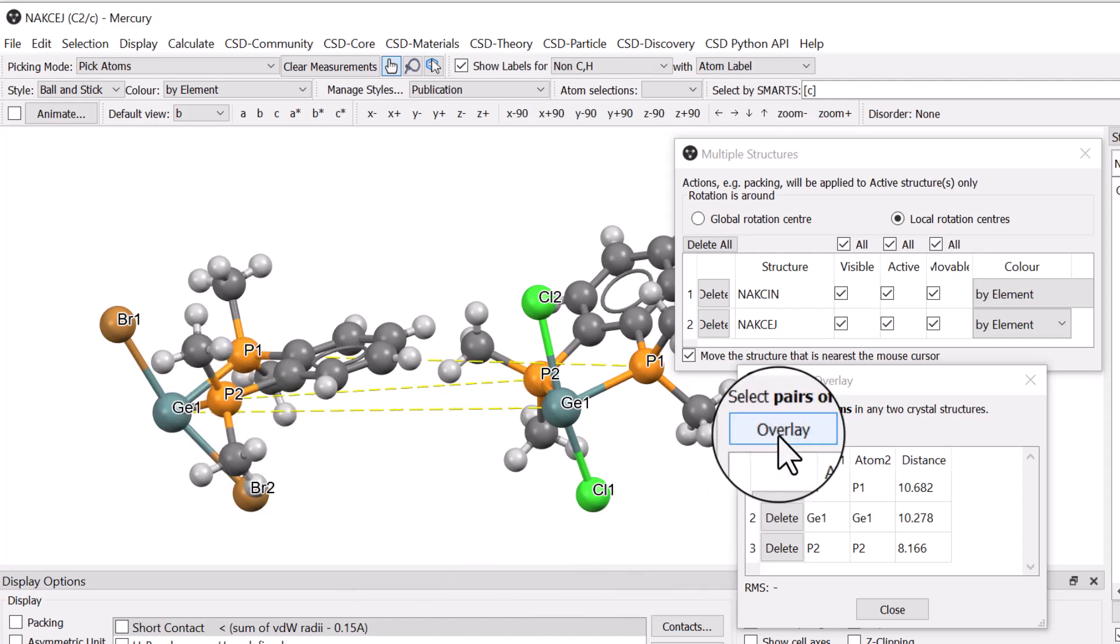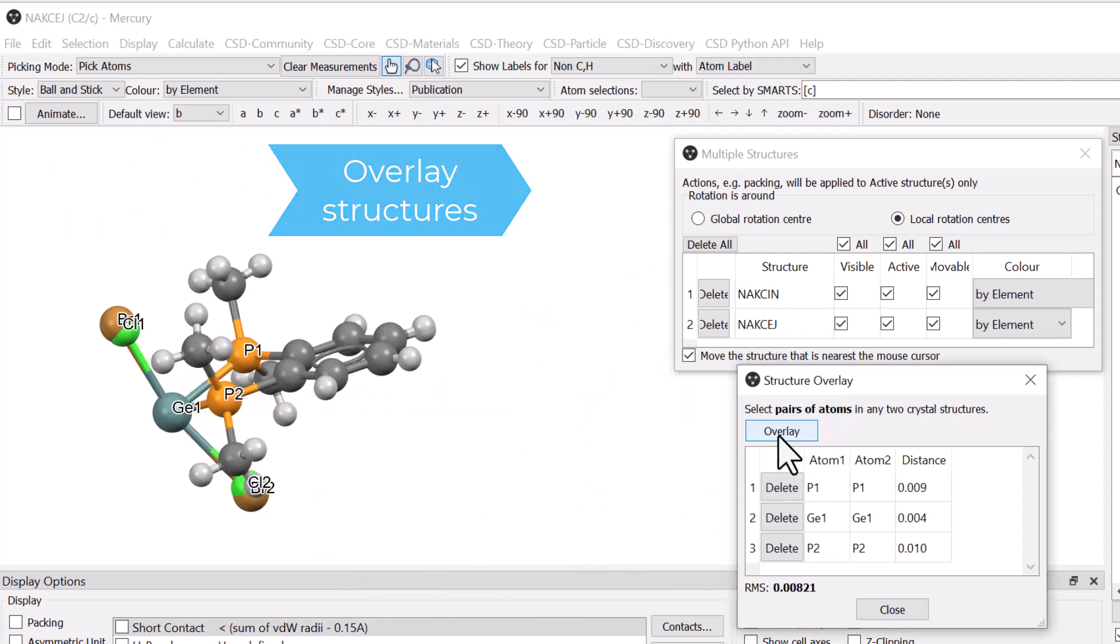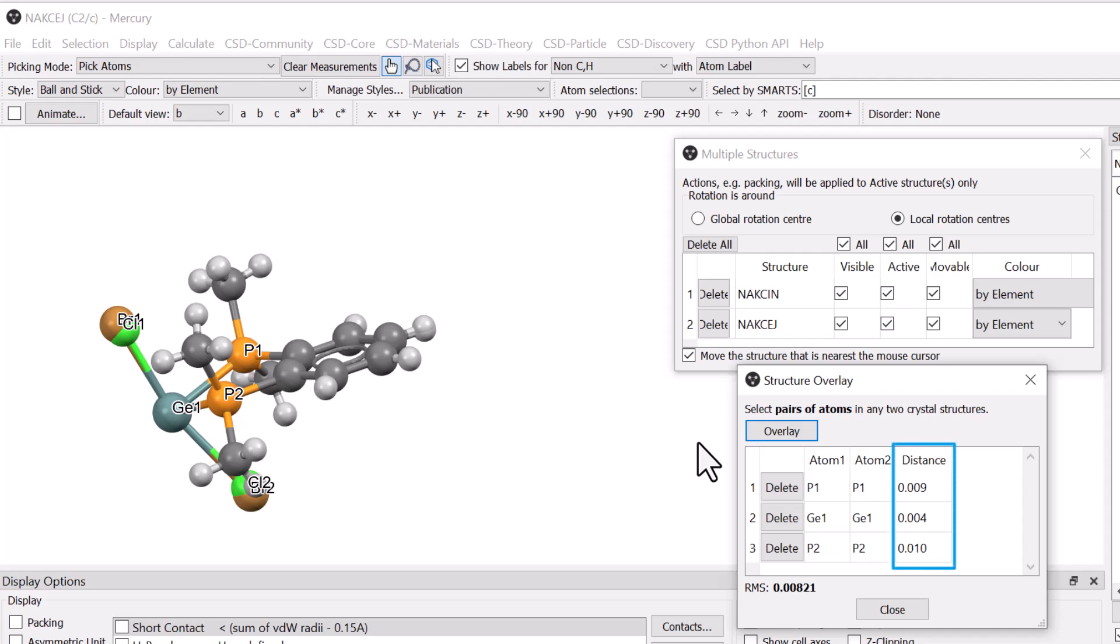Once this is done, clicking Overlay performs the calculation and superimposes the molecules in the visualiser. The separations in the Distance column have reduced to close to zero, which together with the low RMS value indicates a very good fit based on the selected atoms.